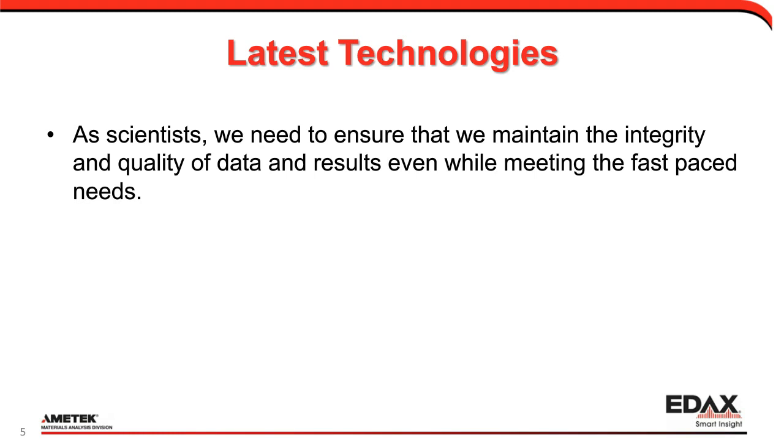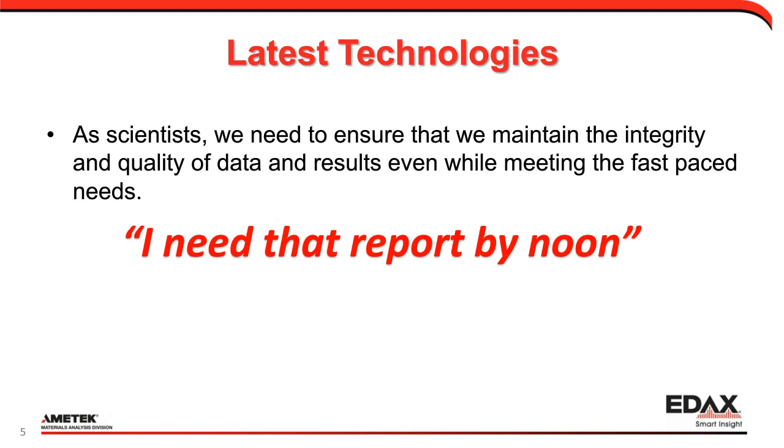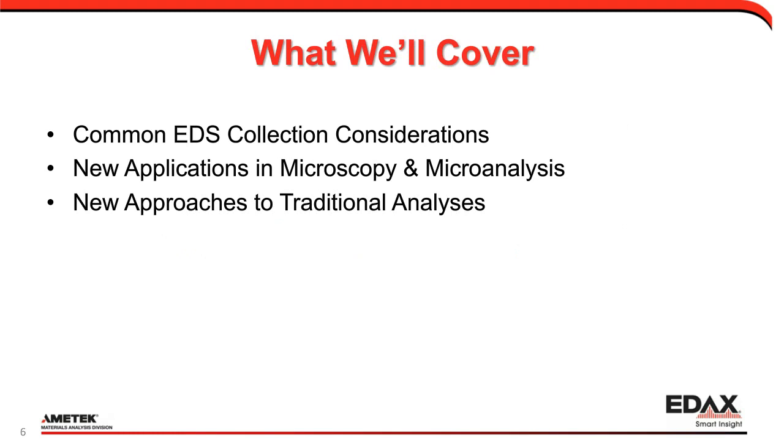Whether we're in industry, academia, university, government, wherever it might be, we are scientists, but still we have an ever-present need to get data reported to other people, to our managers, or in some cases to our professors or our research grants. So there is always the time component. For this webinar, our goal is to make sure that we pay attention to quality when we're addressing common EDS collection considerations.